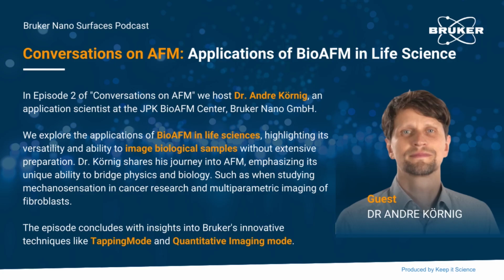So you get results like indentation, forces, and deformation, which in material science, maybe not on the wafers, but in polymer sciences and so on, is very important. I once saw a graph of how many publications were using PeakForce Tapping mode, and it's increasing quite a lot, because it's good to use and gives you a lot of information.